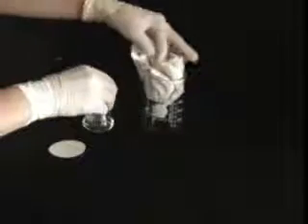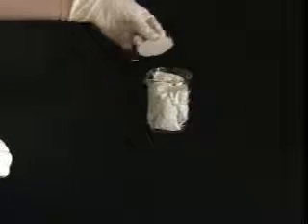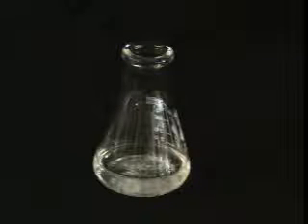The flask can also be placed in a beaker, stuffed with a paper towel to slow down the cooling and promote slow crystal growth. This is especially helpful in a cold laboratory. Ideally, crystals will begin to form as the solution cools. You may want to watch. It can be very beautiful.